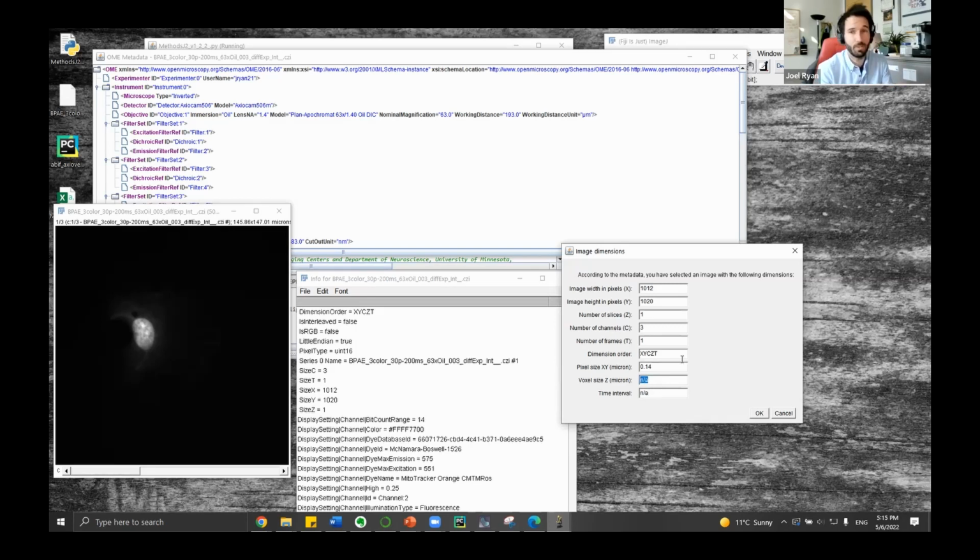There are none particularly in this case, so we have NA, but hopefully those would be sourced by, well, leveraging Bio-Formats. If there is a mistake, the user can go in and change these things, so just add numbers, but we're hoping that it gets it right. If it gets it wrong, then it's up to the user to kind of fill in the appropriate data. So here, everything is right, so we can just kind of move forward.